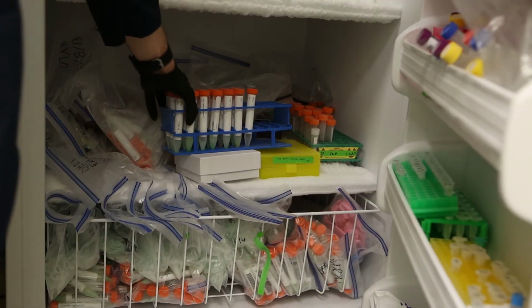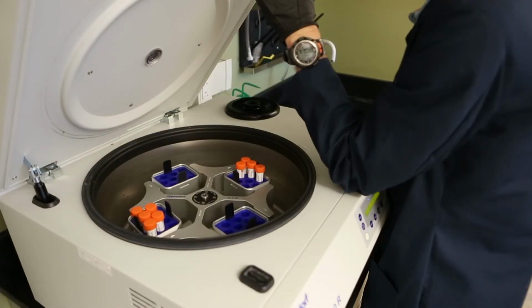And then what we can do is look for proteins in the saliva to see if they're changing. Sometimes it can be proteins, sometimes it can be things like prostaglandins or other inflammatory molecules. And then the refrigerator is actually filled up with samples from literally all over the country that we've obtained from the different clinical studies that we're working on.